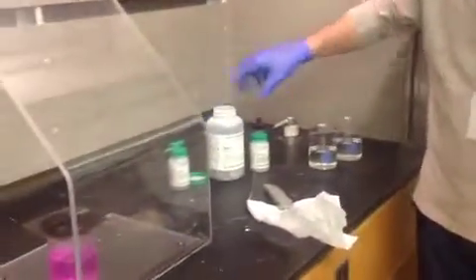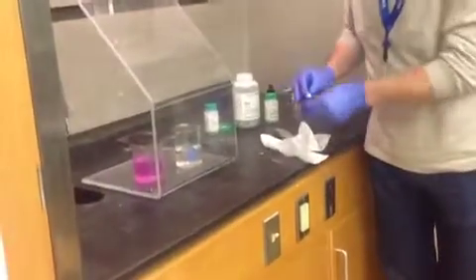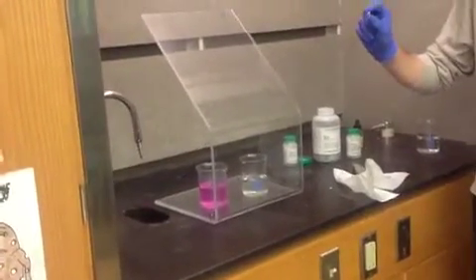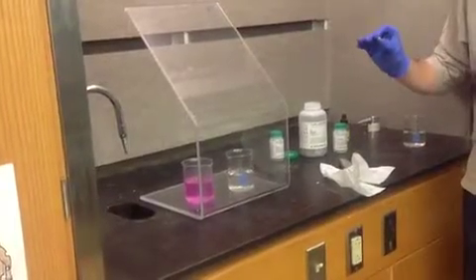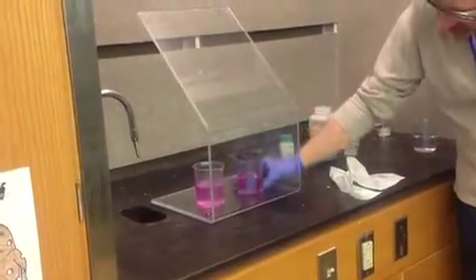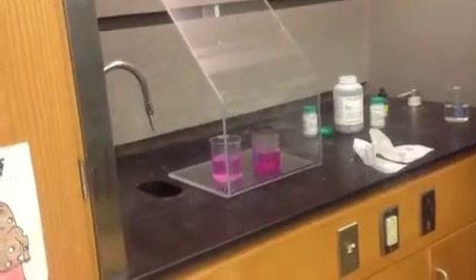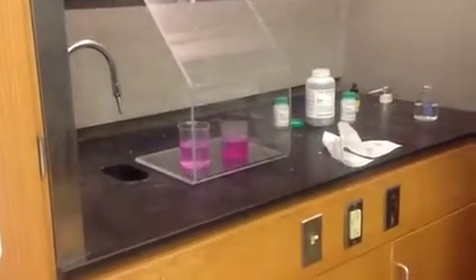Now what happens with sodium is because that electron is easier to remove, it's going to react a lot faster. Now occasionally we'll get an explosion. I'm using about the same size piece to show you how the 3 metals are going to react. I'll put a bigger piece of sodium in to give you an explosion. So a larger reaction. It has formed a ball because it's so hot now that it's melted. And it's formed this ball. You see the sparks coming off? Reacts a lot faster.